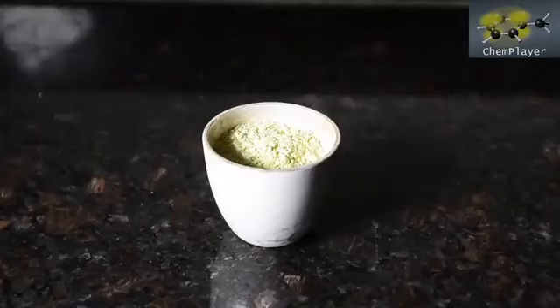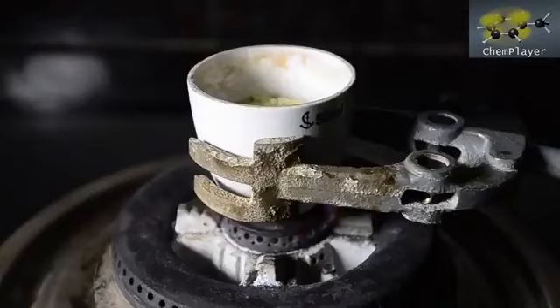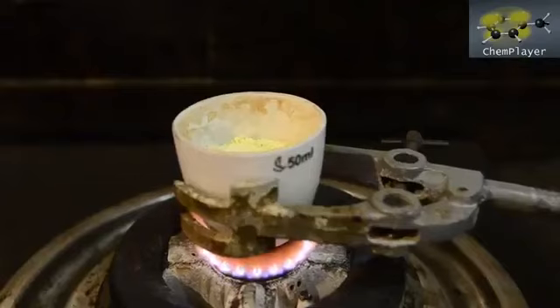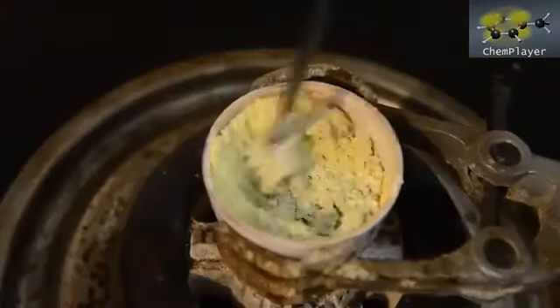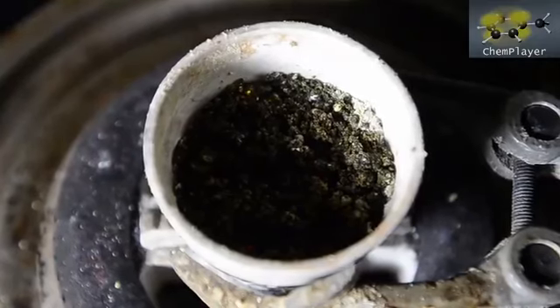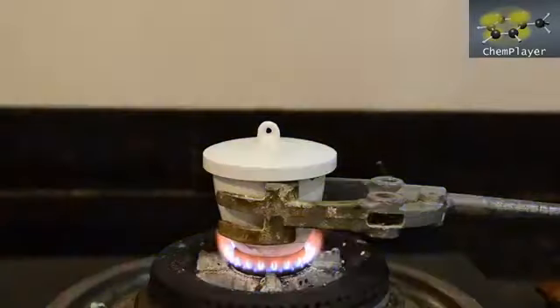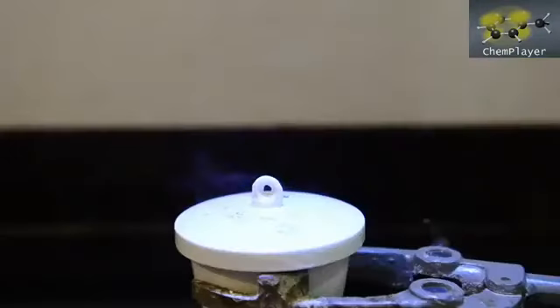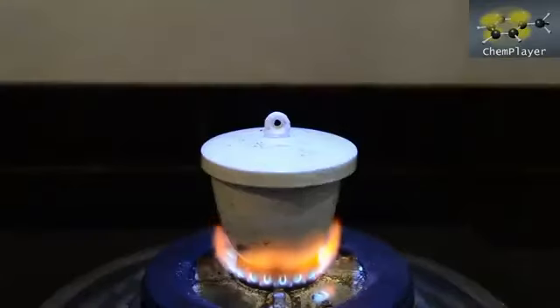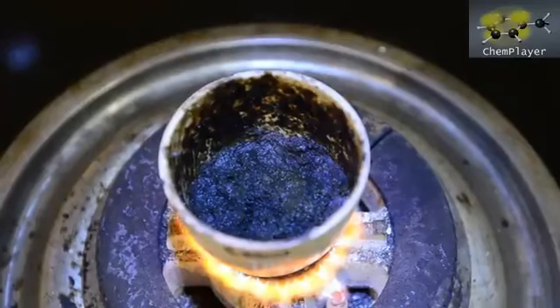And first we heat this to melt the sodium, then we'll mix the sodium into the powder carefully, and then once this is done we can commence the full heating and melting process. Once the stirred mixture turns a dark color, we're ready for throttle up. Risk of carbon monoxide and toxic gases, so get the ventilation on. The mixture will turn spongy and start to foam a little bit.